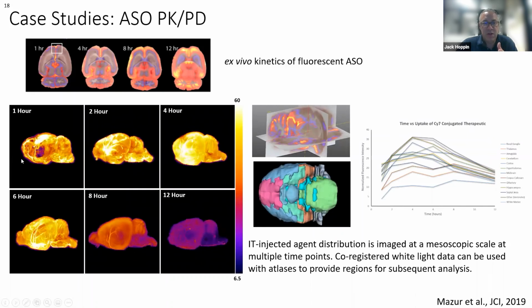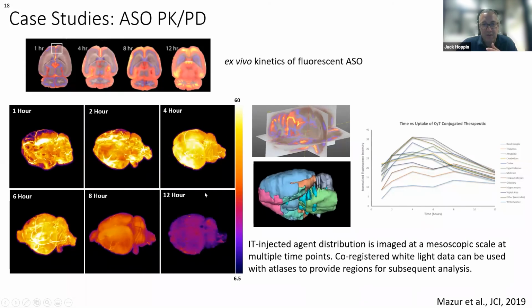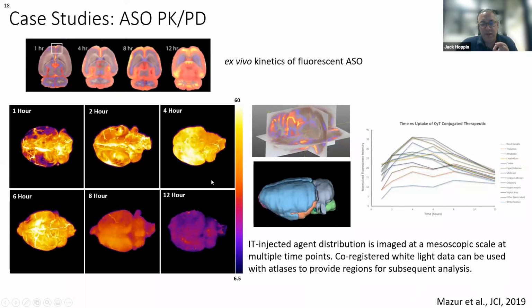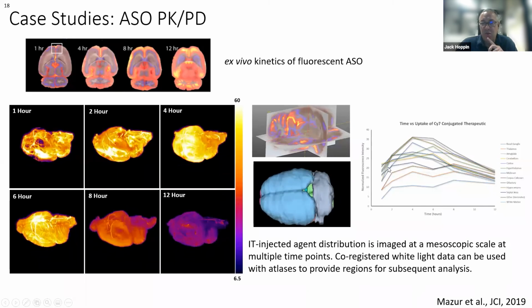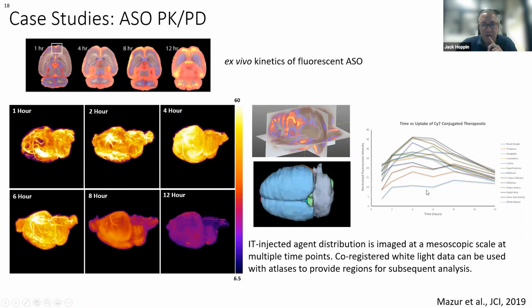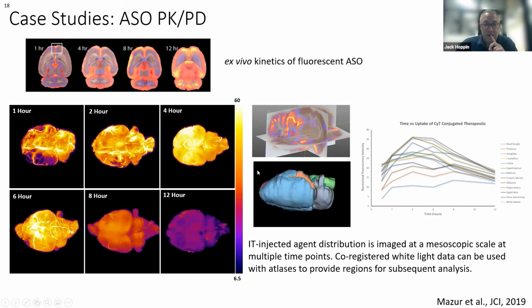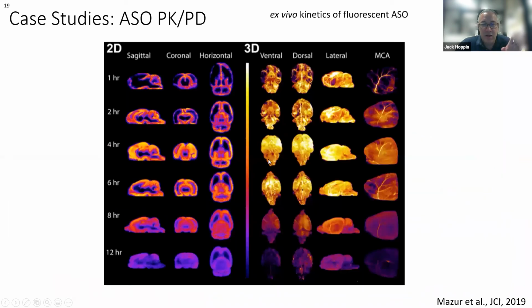Here's that image now in 3 dimensions. We're looking at 6 rats over 12 hours. We're seeing the wash-in and then the distribution, scaled quantitatively, of where the oligo is moving. Because in this case, we then co-registered all of these brains to a rodent brain atlas and looked at, per region of the brain, what the distribution was over time, and very insightful as compared to where things are going in the cortex versus right. I'm not a neuroscientist, I apologize. So my brain anatomy is not that great, but I have done a lot of rat brain imaging. And here you see now a very clear distribution schedule, and very insightful as to where the oligo is going in the rat brain.